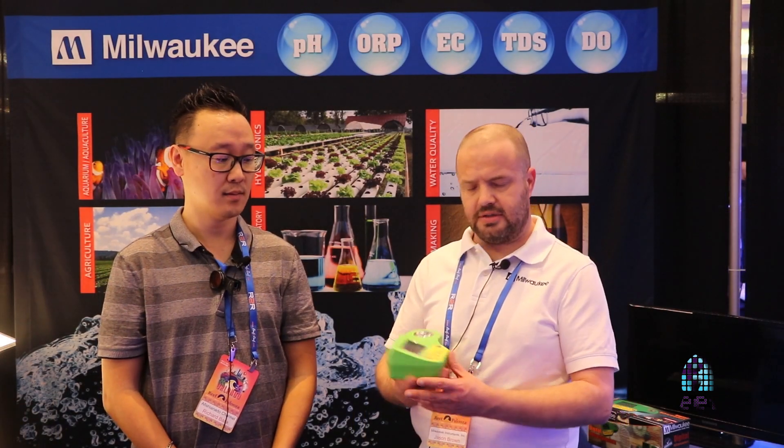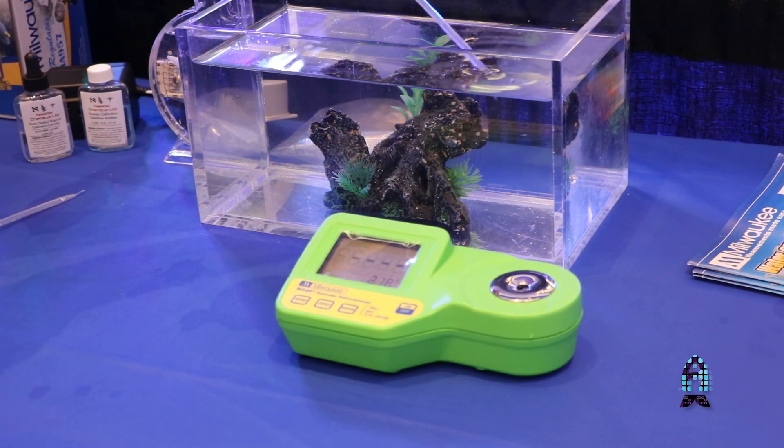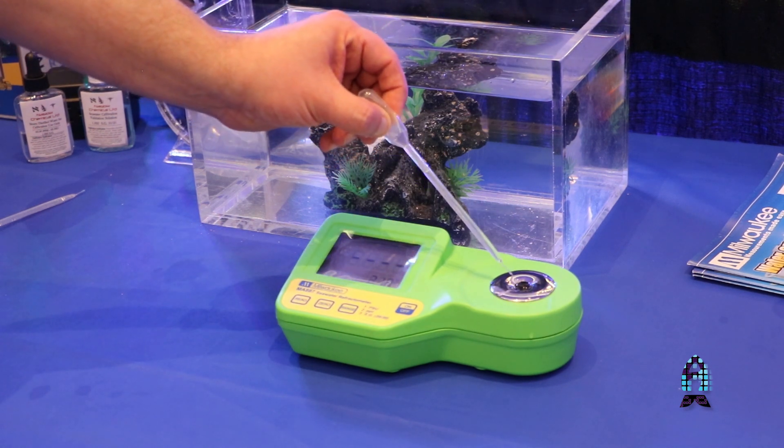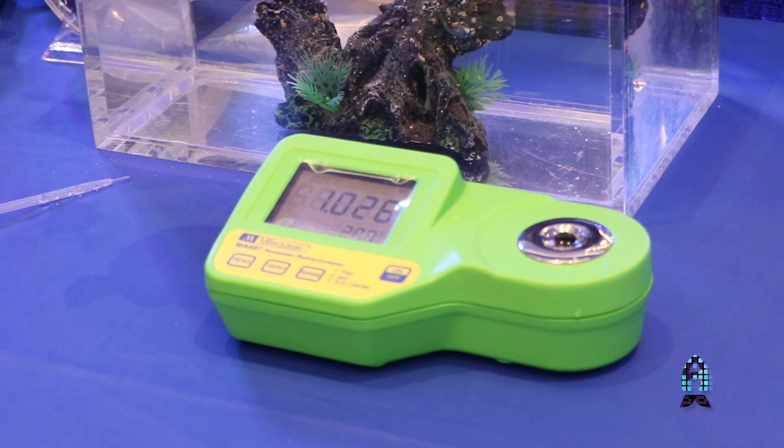What do you have for us here today? So I want to discuss salinity. What we have here is a seawater digital refractometer, one of our top selling items. All you do is basically put the sample on the well here, hit your read button, and it's going to give you your salinity and specific gravity.